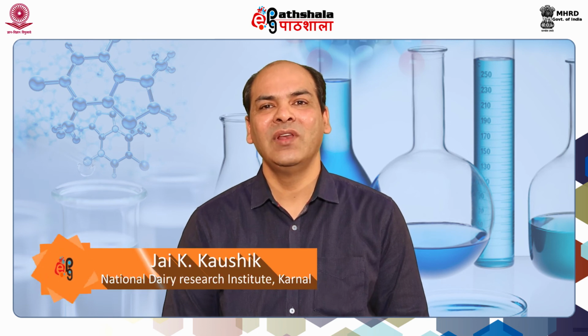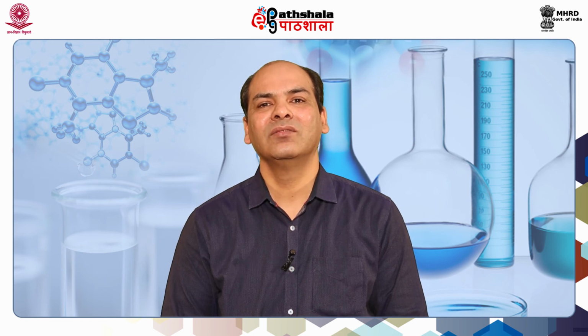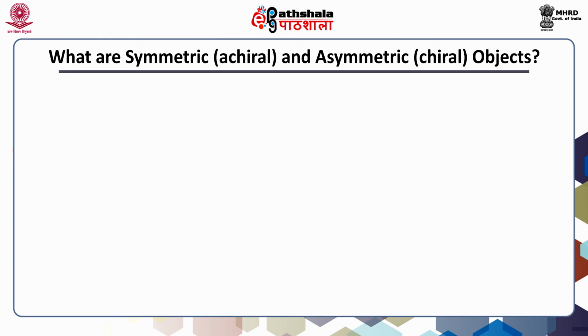In the next slide we will see what the molecules are which are asymmetric, which we call chiral. In the previous slide we saw the asymmetric and symmetric shapes. Now we can extend the same concept to molecular structures. Now let's see what is the meaning of molecular asymmetry. It can be of two types, structural or configurational asymmetry and conformational asymmetry. In the case of small molecules, we can see the structural asymmetry.